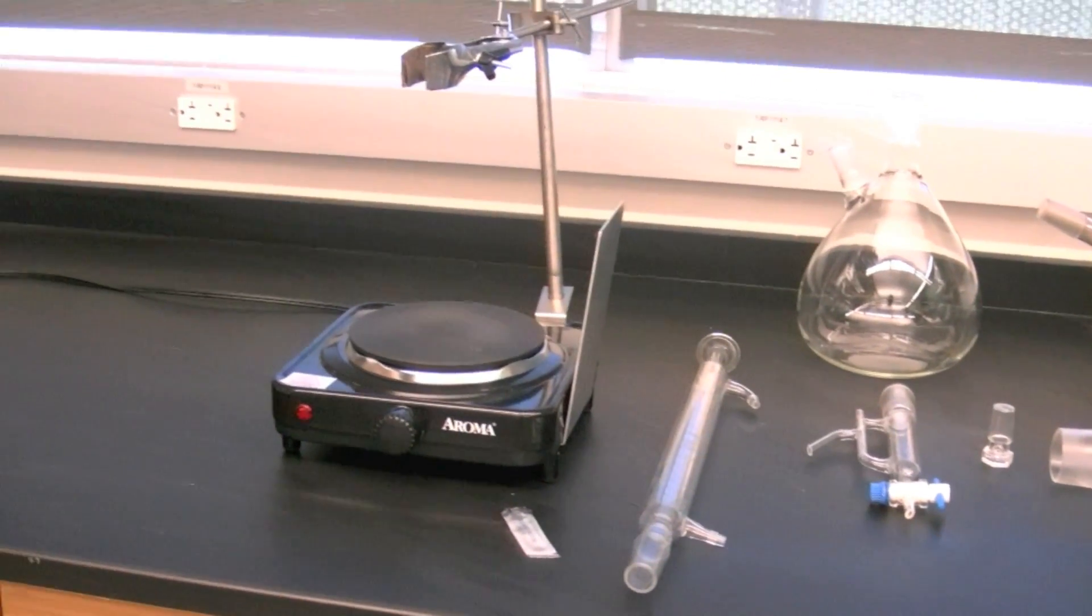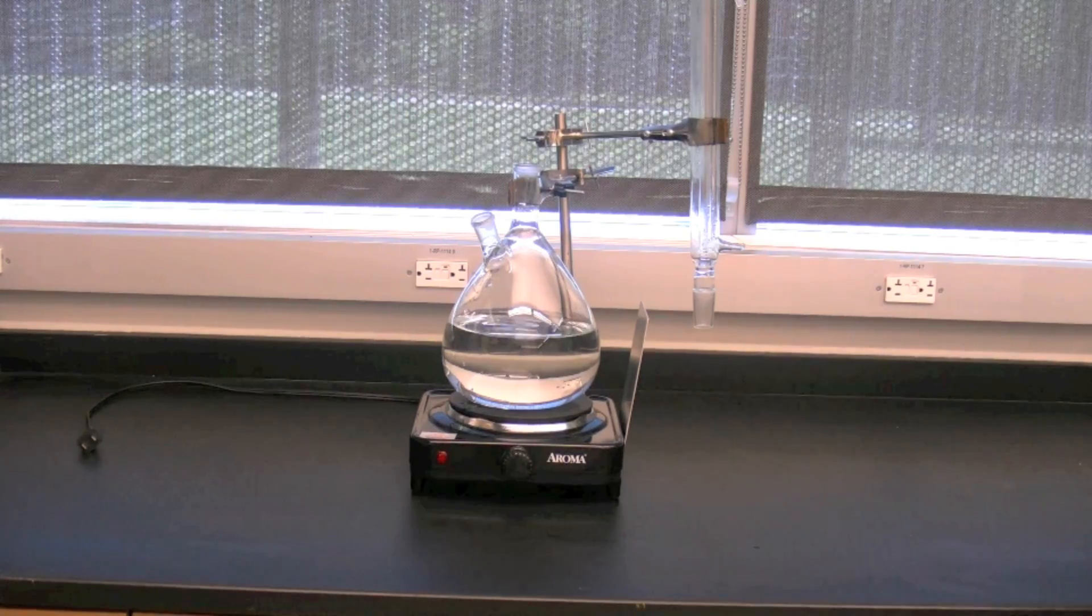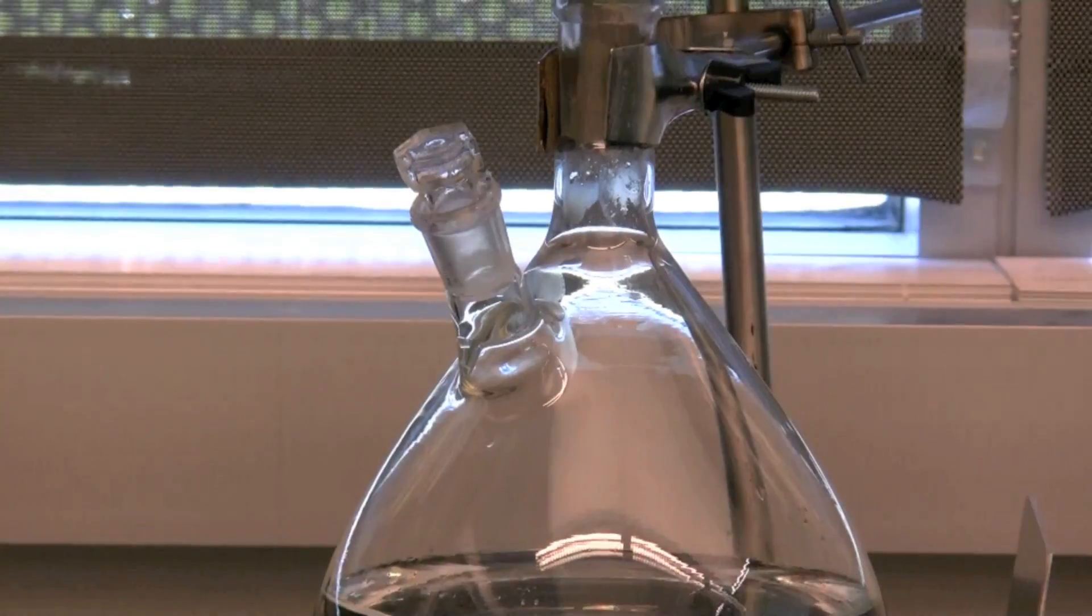Fill the boiling flask with approximately 1.25 liters of distilled water. Place the boiling flask on top of the hot plate and secure it in place with a tube clamp around the neck of the flask.